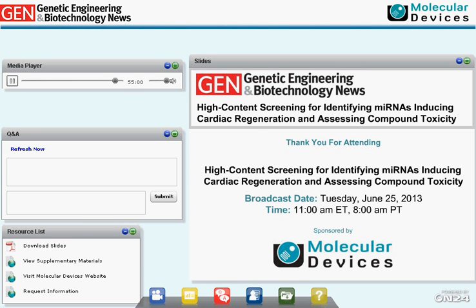All right, Vicki, here's another one. What is the typical runtime to capture an entire 96-well assay in 2 colors? Typically, in 2 colors, by capturing a single image per well, you can image an entire 96-well plate in 3 to 4 minutes.